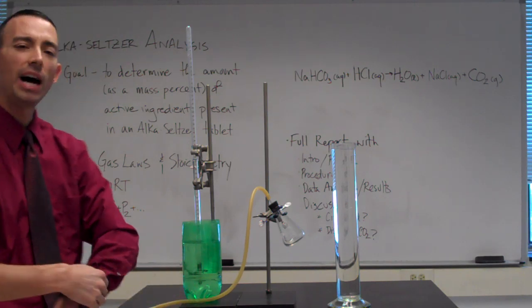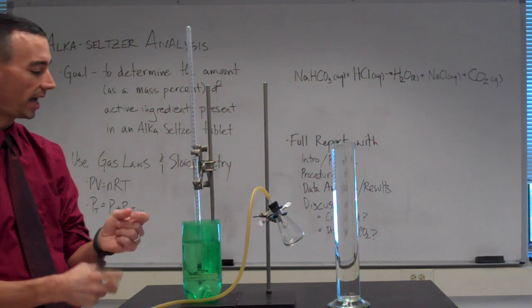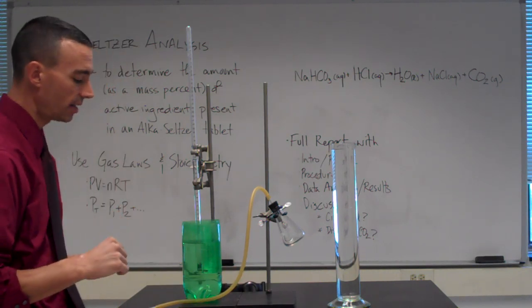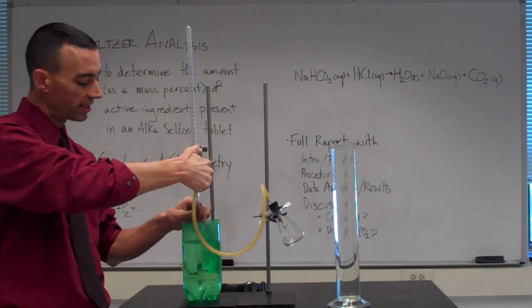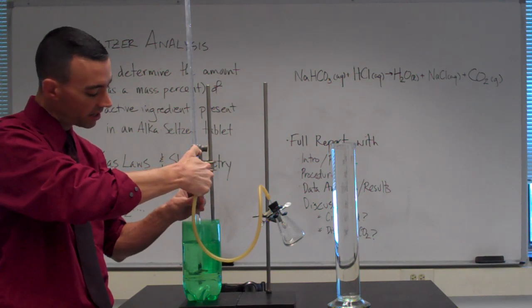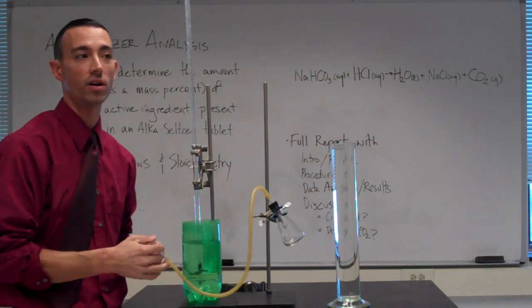The liquid, not right now as part of the pre-lab, but the liquid, when you're working with it, will have some acid in it. So if you have really sensitive skin, please be careful, or maybe ask your lab partner to do it. I'll demonstrate a quick way to do this. I'm going to slide my tube up so that its bottom is just below the water level.